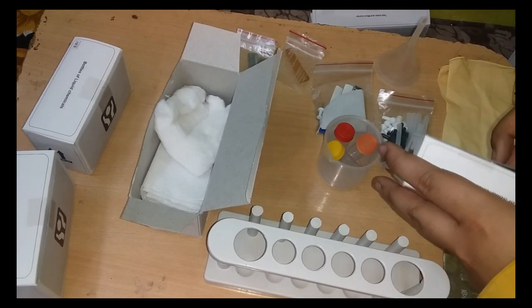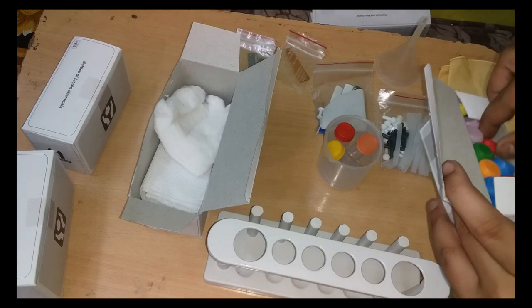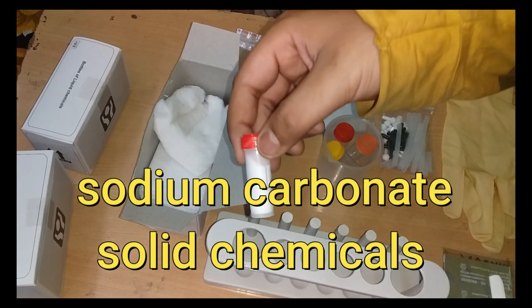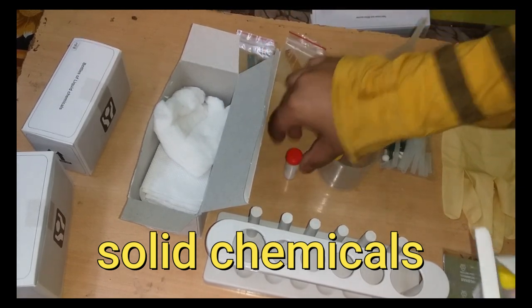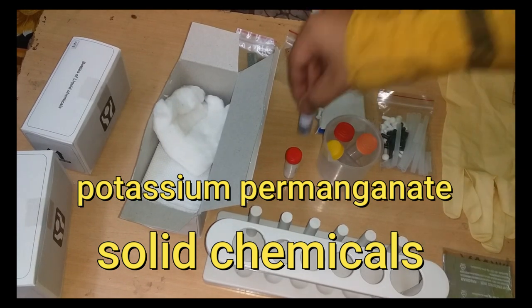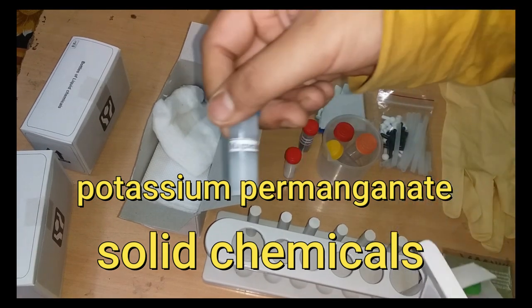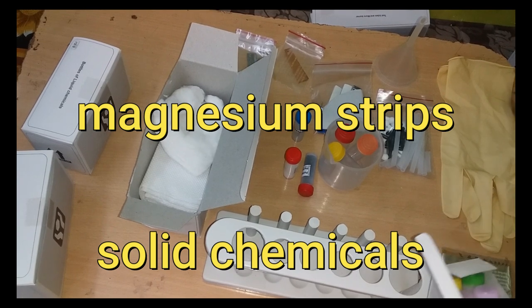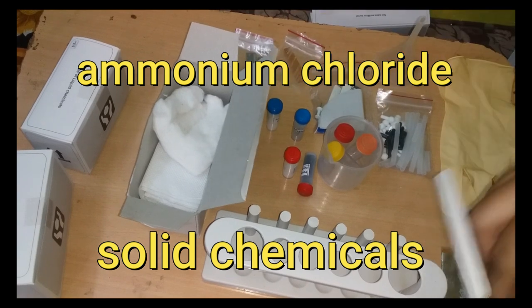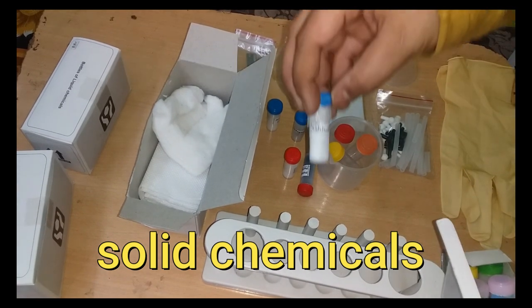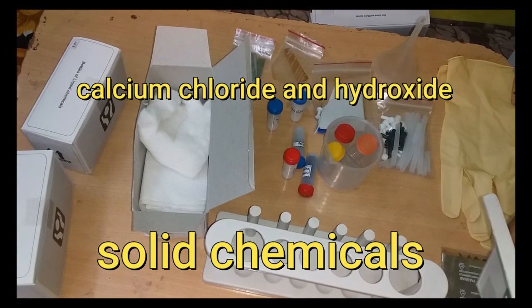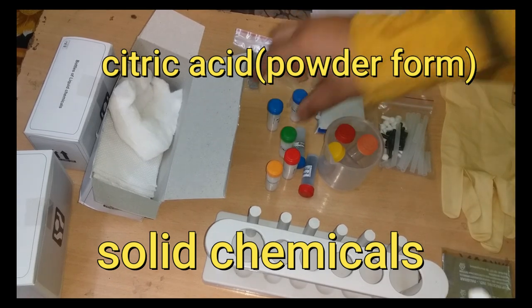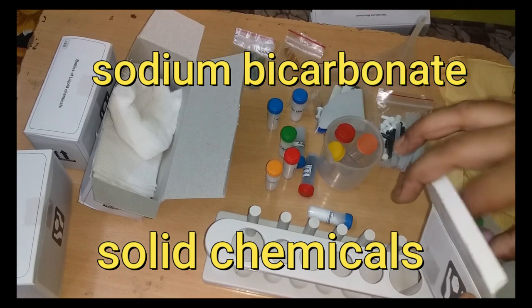Now I will be unboxing the bottles of solid chemicals. Sodium carbonate is the first chemical I unboxed. Potassium permanganate, magnesium strips, ammonium chloride. This is calcium chloride and calcium hydroxide. This is citric acid powder form. Sodium bicarbonate - baking soda.